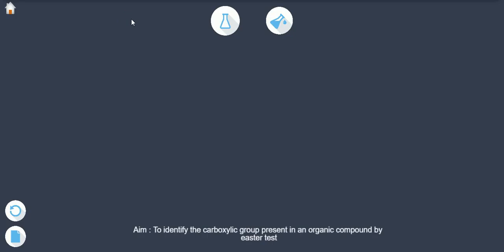Aim to identify the carboxylic group present in an organic compound by the Esterification test.